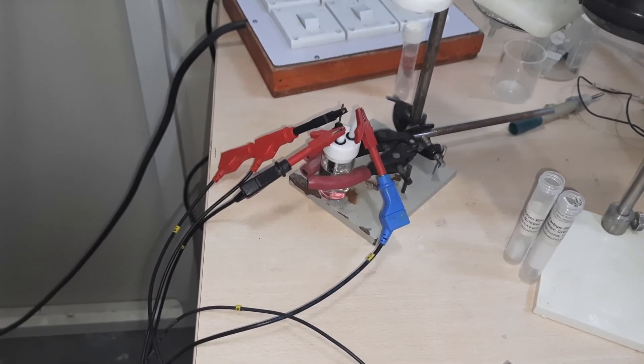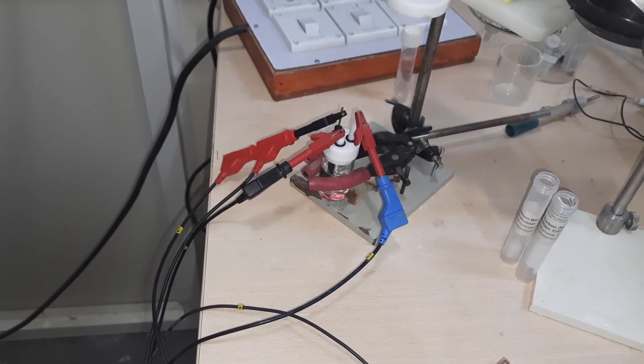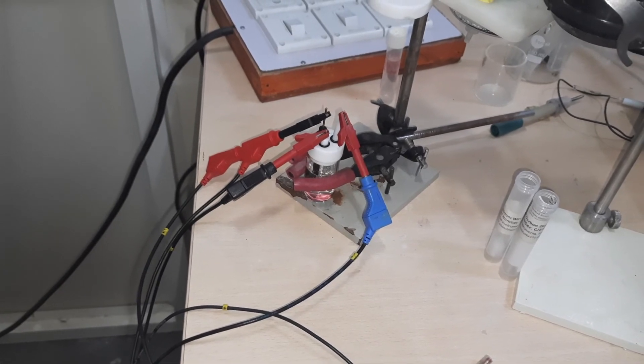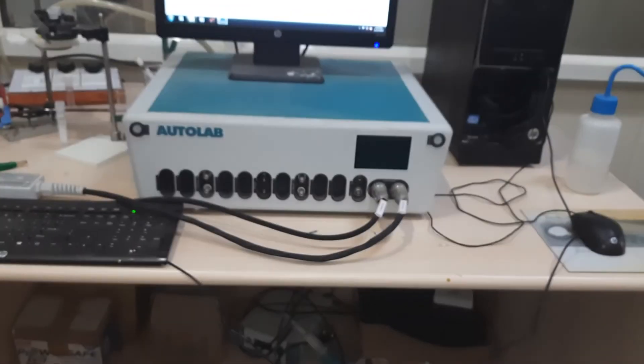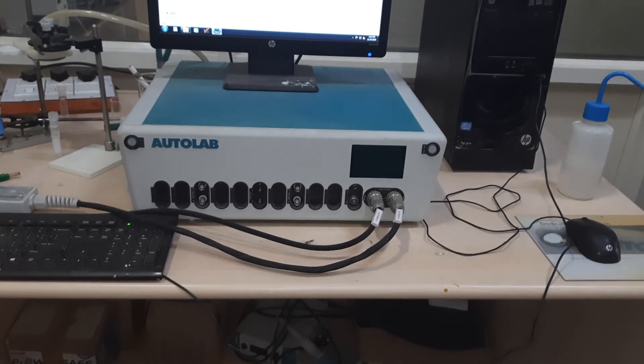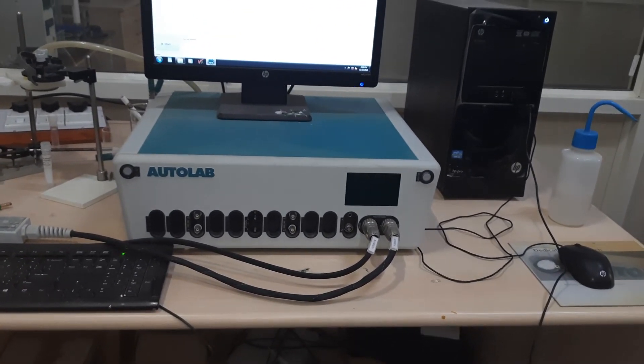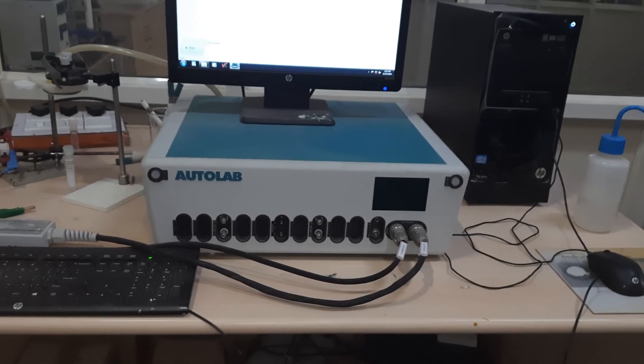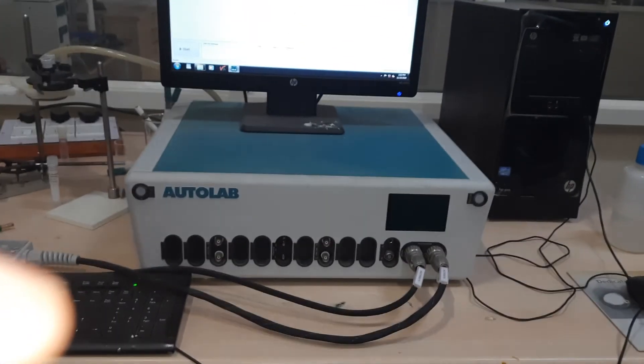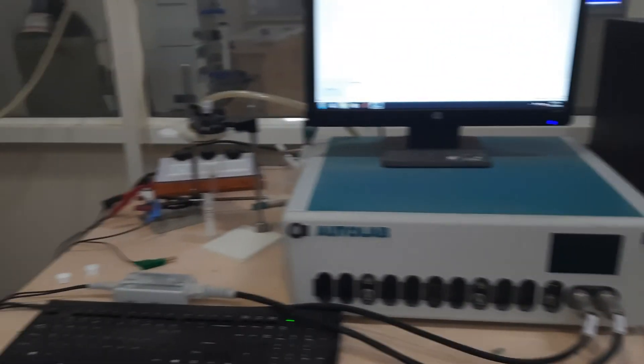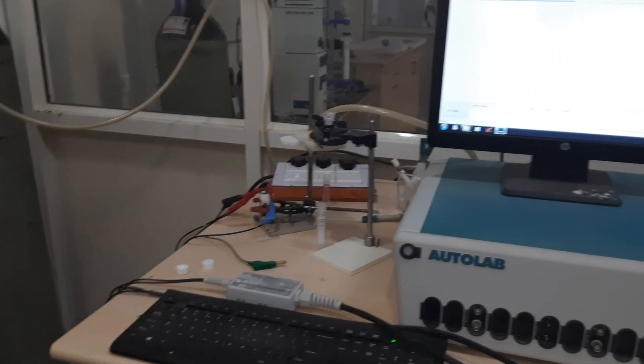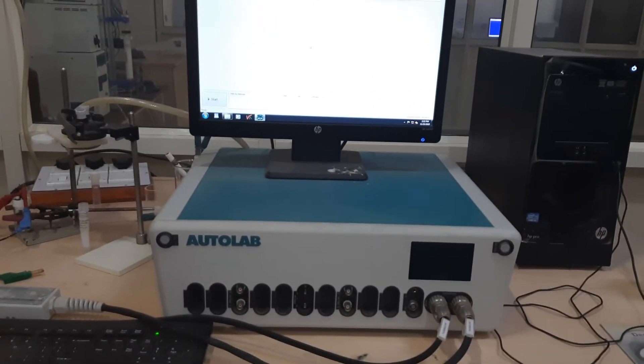So let us see how the cyclic voltammogram for the solvent blank looks like. Now we are back to the machine, the Autolab. Here we need to first, after the setup is complete, come here and switch it on.